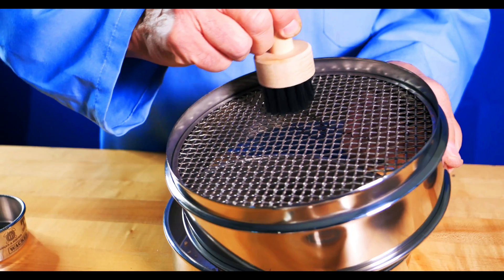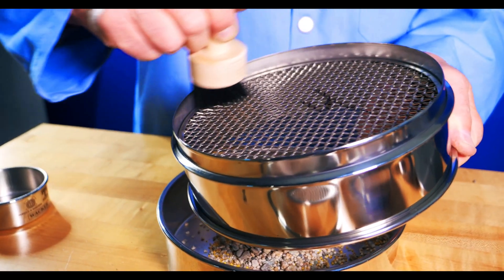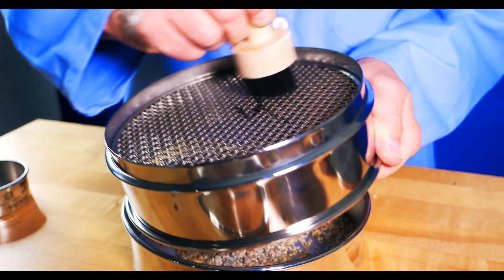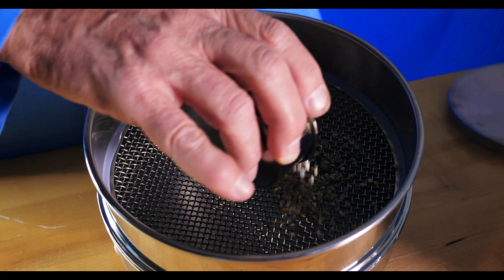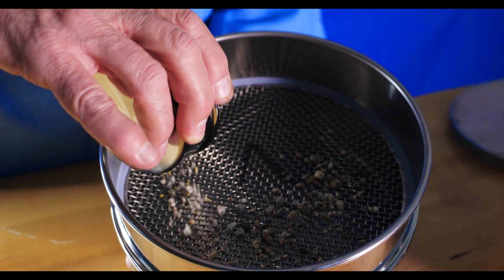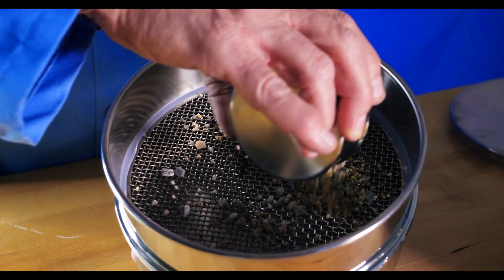Hand sieving can be performed anywhere with a single test sieve or, less commonly, a small stack of sieves. Prior to conducting a hand sieve analysis, you'll want to first ensure the test sieve is clean and free of any debris from previous testing. The next step would be to obtain a representative sample of a manageable size. You should make sure the sample doesn't cover the surface of the sieve cloth in its entirety and that the particles have room to move over the mesh to find the openings. You should also have a scale and something to record your data.